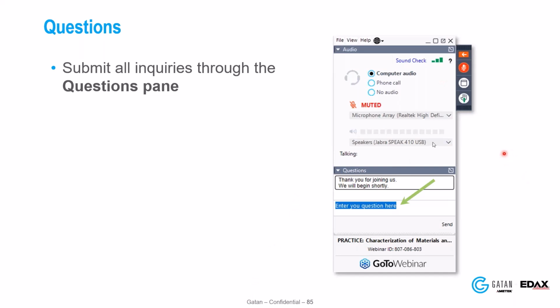Okay, that might be the last of the questions. Any more here in the classroom? Have you guys tried to run any indexing live? You're saying you run patterns, say up to 5,000, or maybe 2,000, to see if you get patterns on the fly.